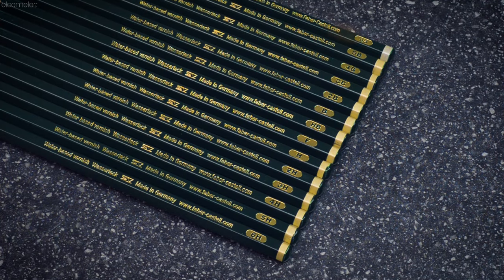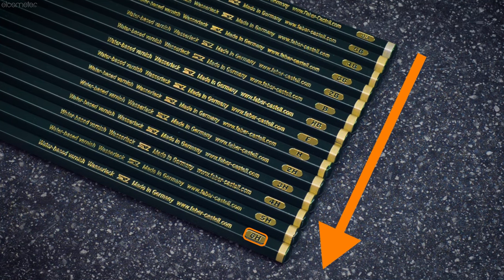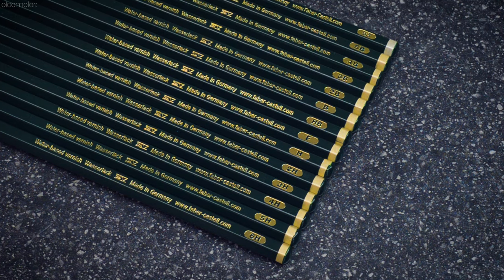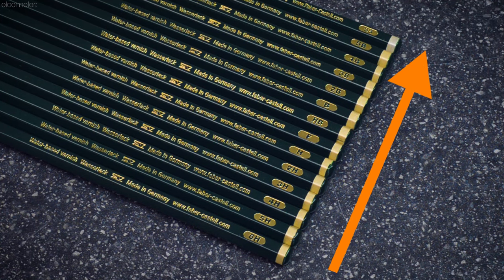The pencil hardness is increased from B (soft), through HB (medium), to H (hard), until the coating is scratched. Alternatively, depending on the test method, you may start with the hardest pencil and then decrease the pencil hardness until the coating isn't scratched.